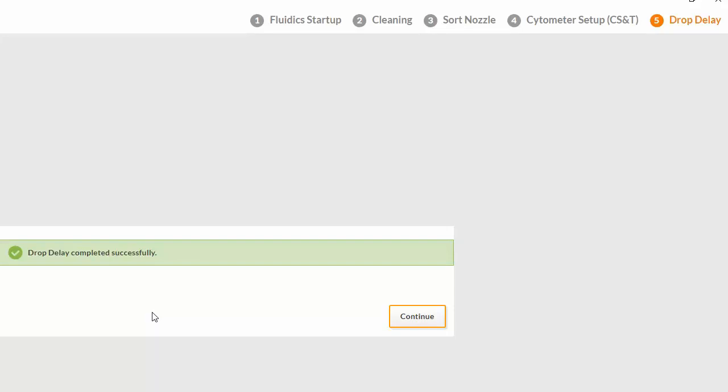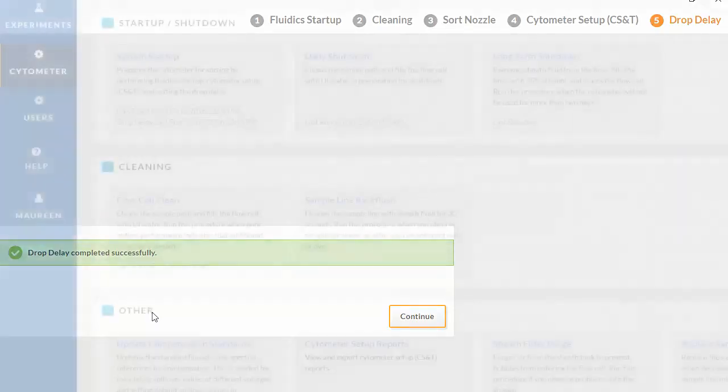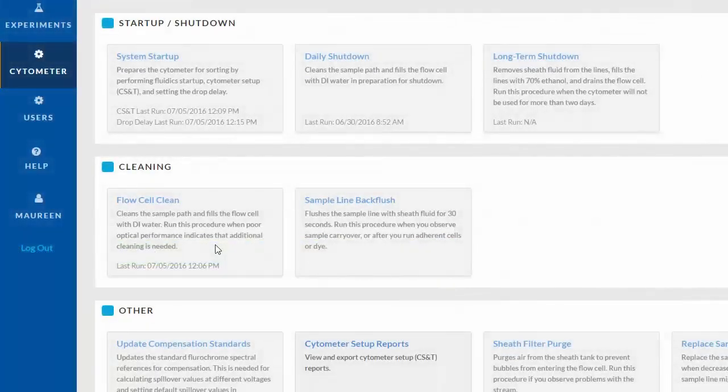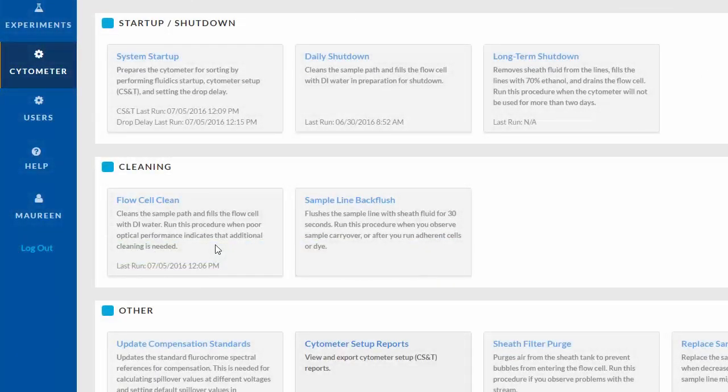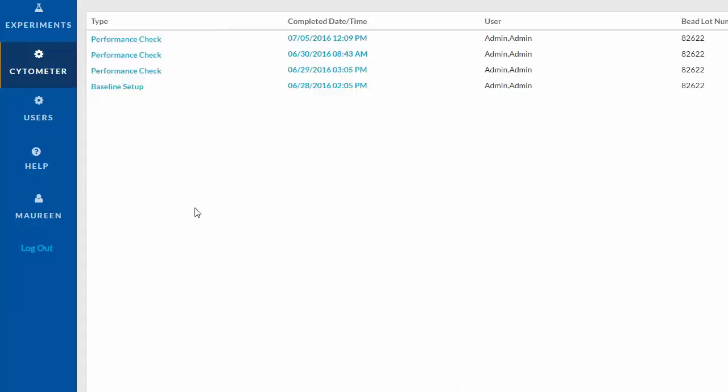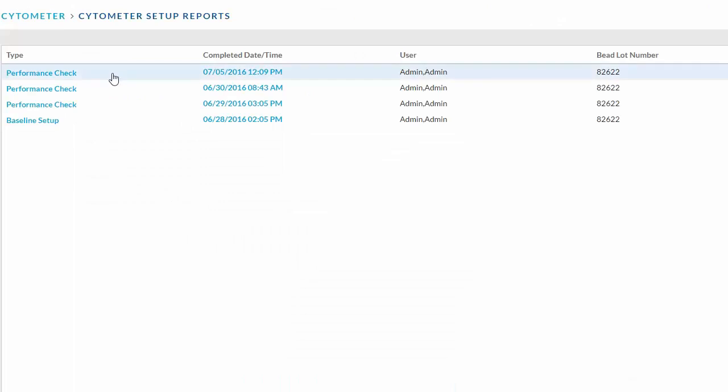Once drop delay has completed successfully, click Continue. To view the CSNT report, click Cytometer on the navigation bar and then select Cytometer Setup Reports. Choose your report and click Export to save it as a PDF document.